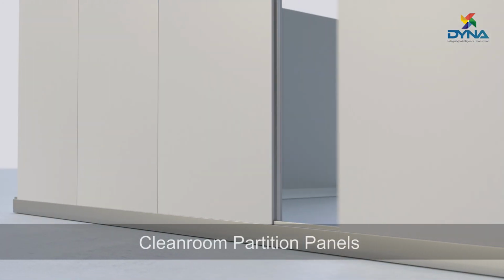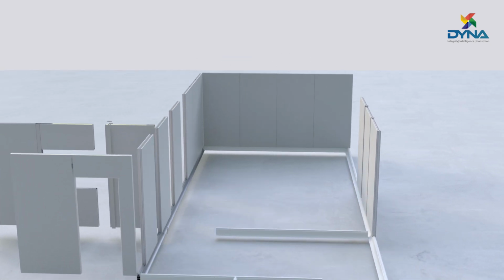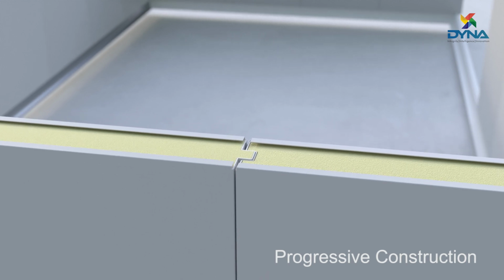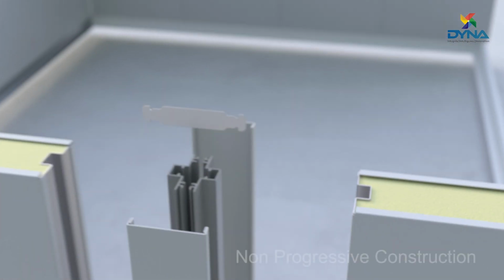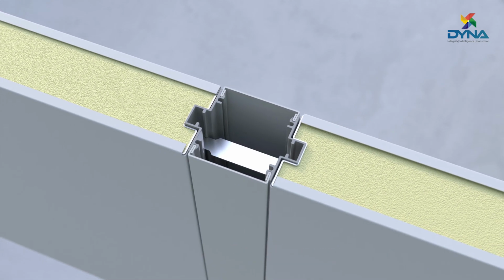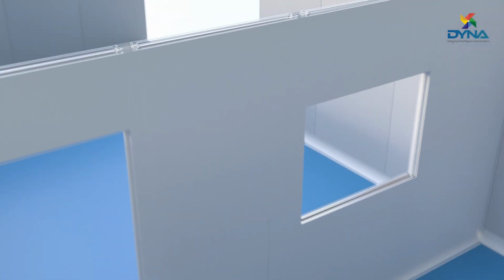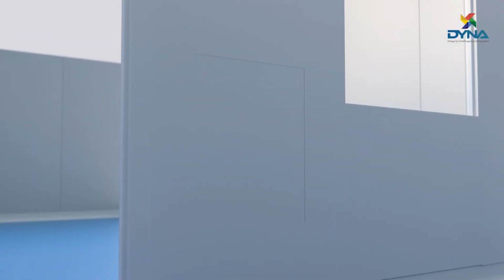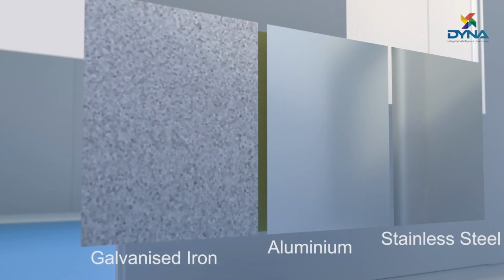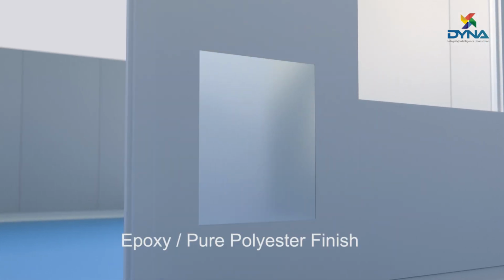Dyna's cleanroom partition panels come in both progressive and non-progressive models. Progressive panels need minimal changes in future, whereas non-progressive panels allow easy installation and dismantling without disturbing other panels. Dyna's cleanroom panels come in galvanized iron, aluminium, and stainless steel, with options of Rockwool and PIR insulation. They are finished in epoxy or pure polyester.